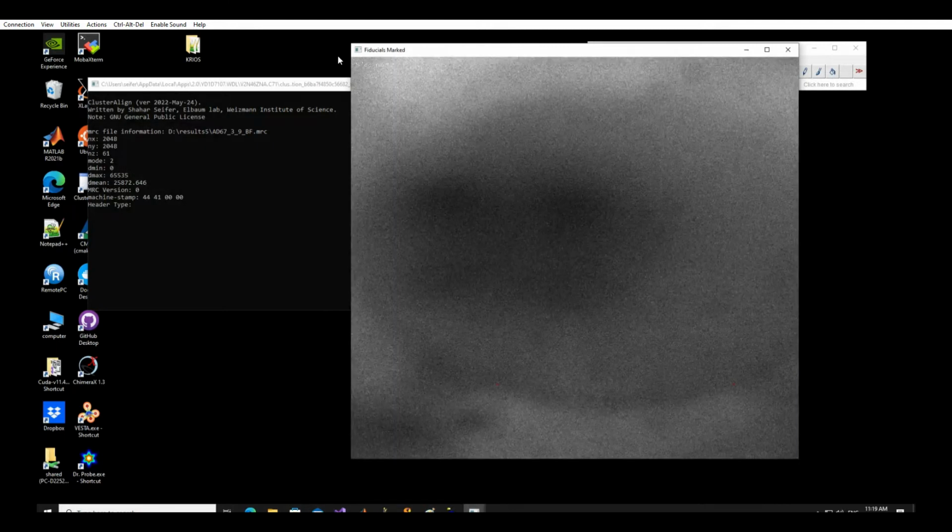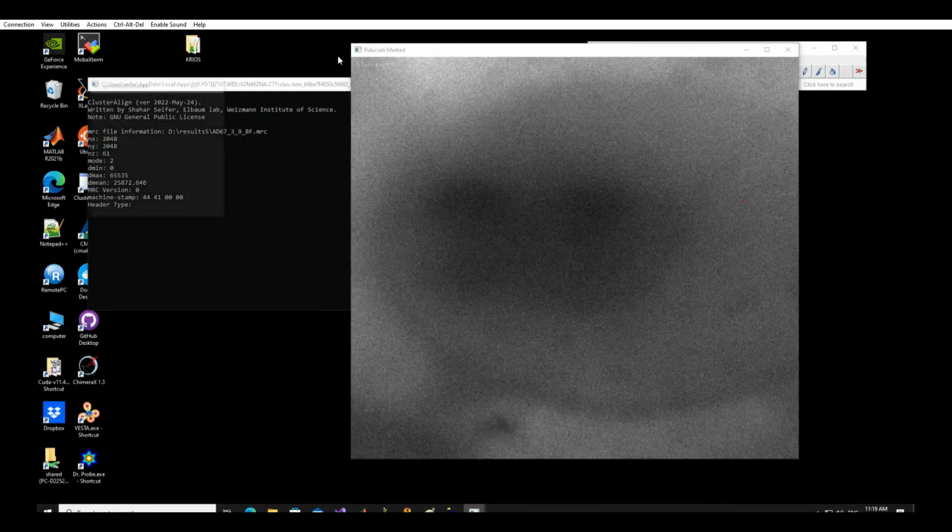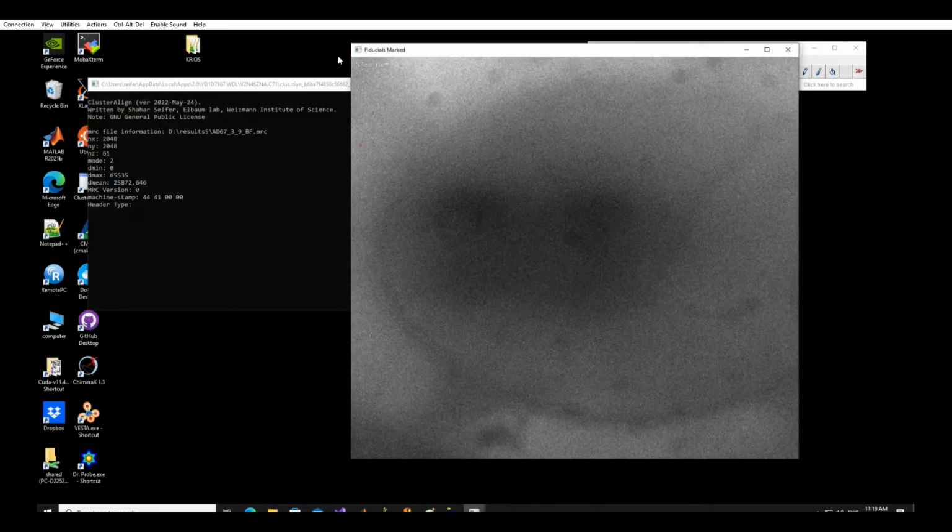In some projections that are out of focus, the particles are missing, so those images will be ignored in the reconstruction. Rare artifacts will be ignored as well, since only points that appear in specific positions in clusters may be approved as fiducial particles.